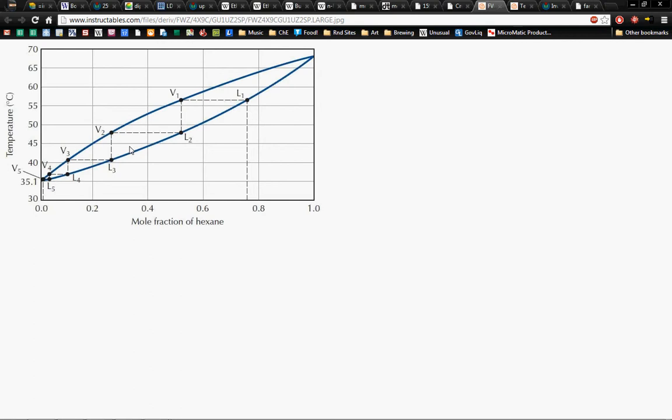And to demonstrate that, I've got this graph which you've got in your lab manual. And this may look pretty confusing, but it's actually not too bad. So essentially, this is your mole fraction of whatever substance you're using. So if it's 100%, let's say ethyl acetate, then you would just be right here, and you wouldn't have to worry about distilling. But let's say we're using like a 50-50 mixture. So we would essentially start right here and go up, or let's just stay with their example, let's say we're using a 78% mixture.